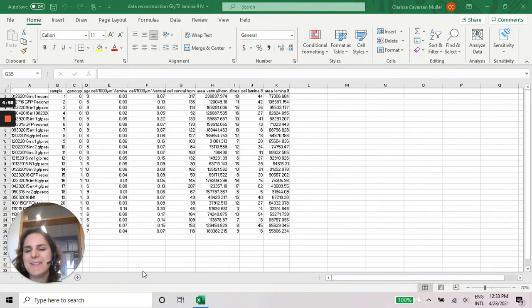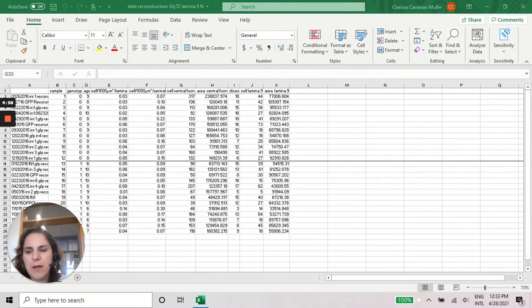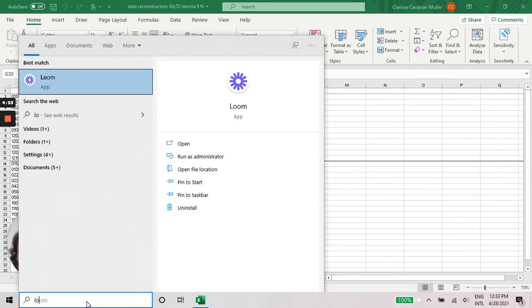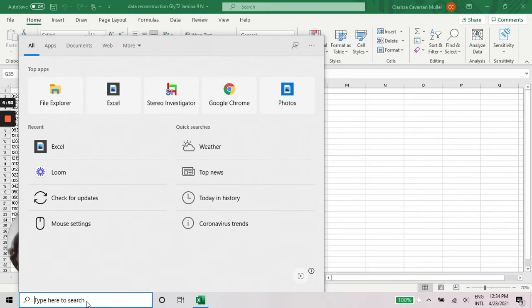Hi! So in this video I'm going to show you how to create a scatterplot graph in GraphPad Prism.